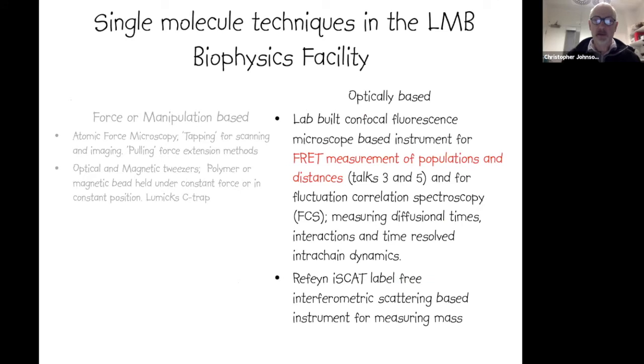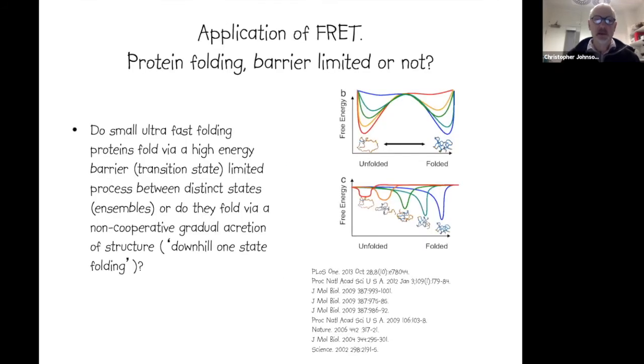So let's talk about some FRET work that we've done with this system. I'm just going to mention an application where we used FRET to address a question in protein folding. Protein folding is historically a very long-standing problem.